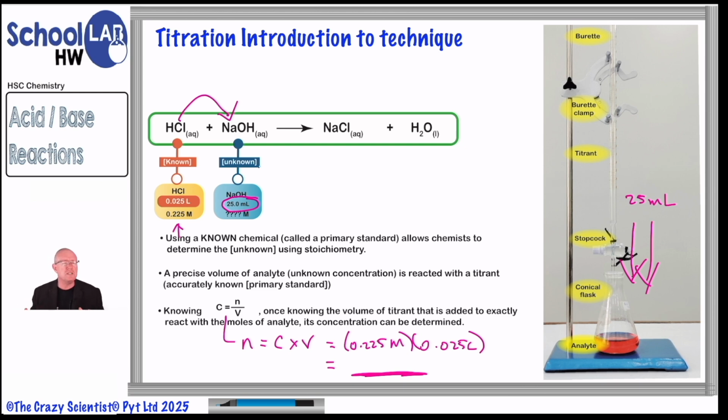So that's the general principle of titration on a very simple level, is that we have a sample of unknown, the analyte in the flask, we have a sample of known in the burette, we add that to undergo a neutralization reaction. As that neutralization reaction goes, the pH changes. When it reaches the point at which we have neutralized the solution, then the reaction should stop, and we use an indicator to tell us that. Okay, so that's the basic idea.